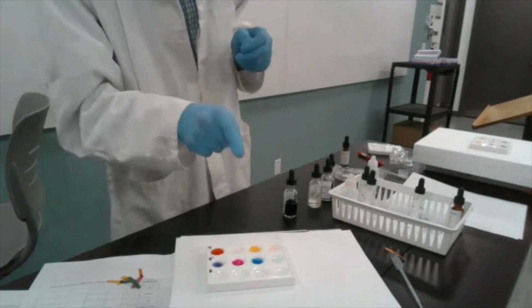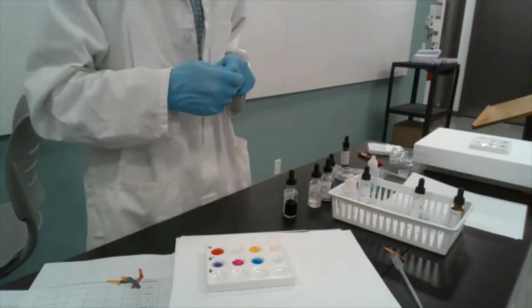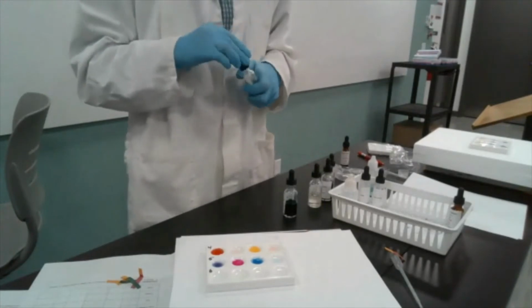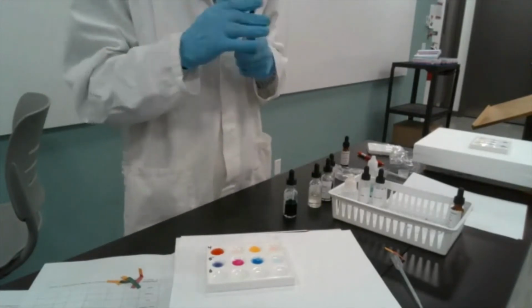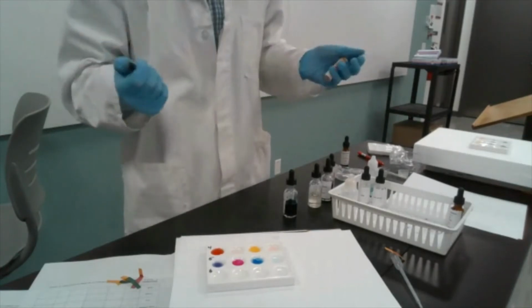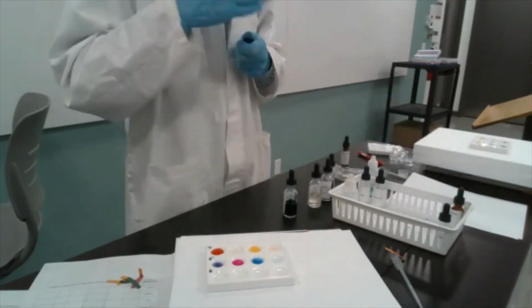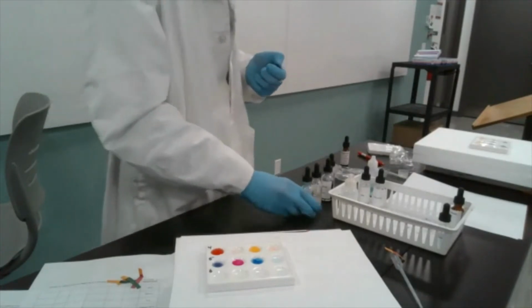So that was glass cleaner. Now, soap solution. This is an interesting one. And the reason why it's interesting, some people might think that soap is a strongly basic substance. Because all of us, we've heard stories about soap changing the skin's pH, harmful for skin. You don't want to wash your hands too many times because it dries your skin and whatnot.